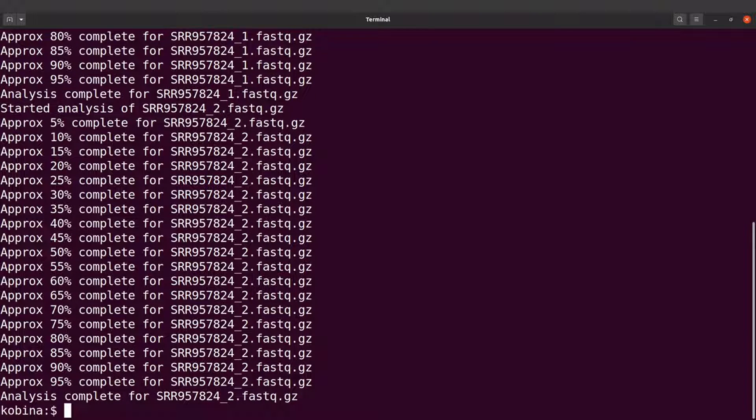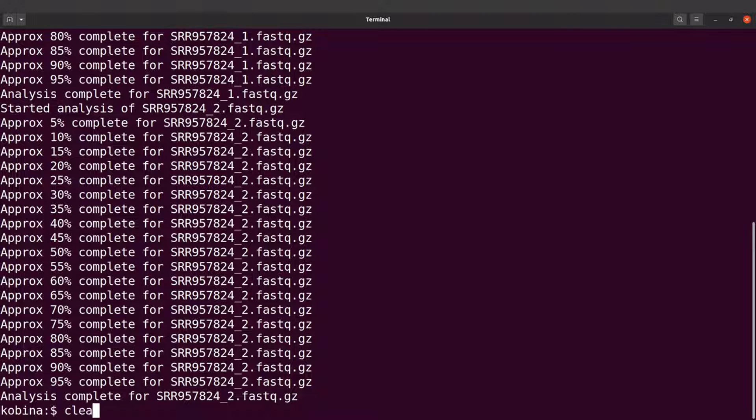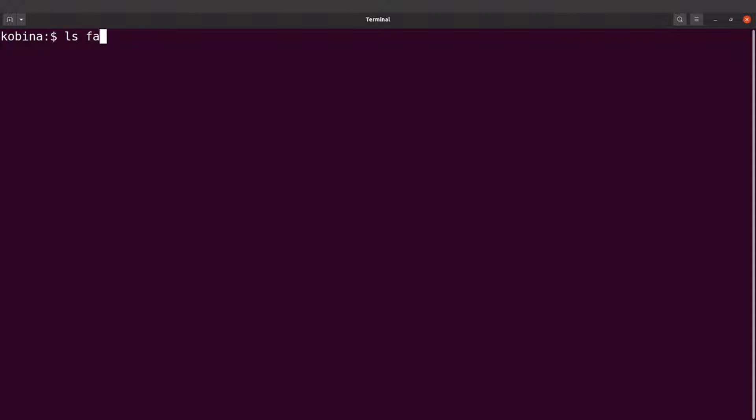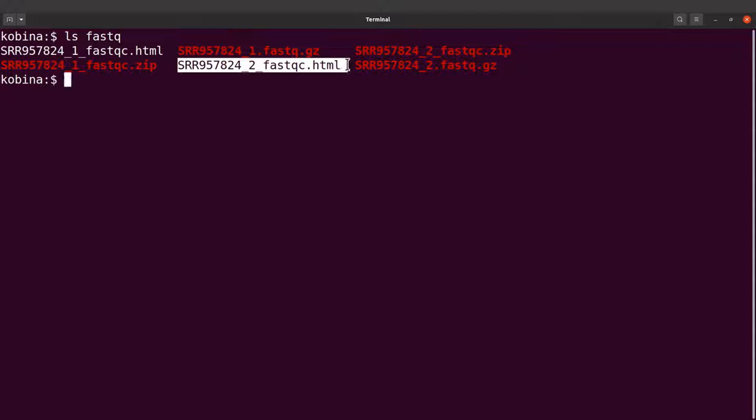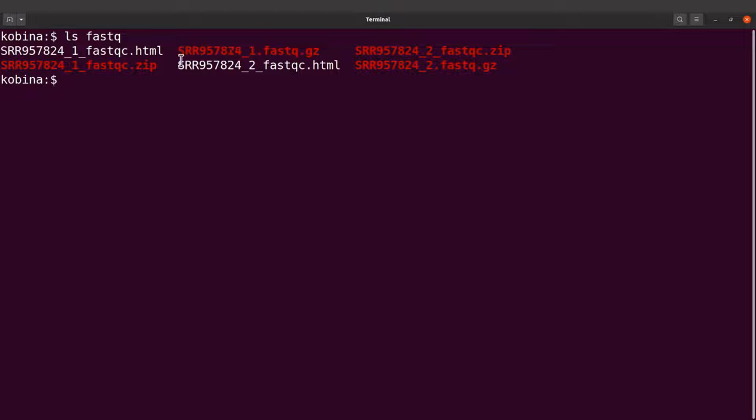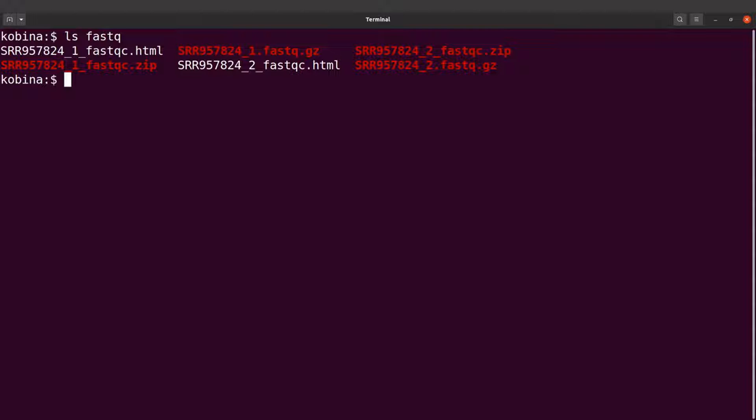FastQC has completed its job, so let's check them out. If you do an ls into the fastqc directory, you'll find some HTML files there. These are the FastQC reports. These HTML files can be opened with a browser. We will look at that very soon. Now what we did was run FastQC on all the files in the directory, but you can also specify a single file.